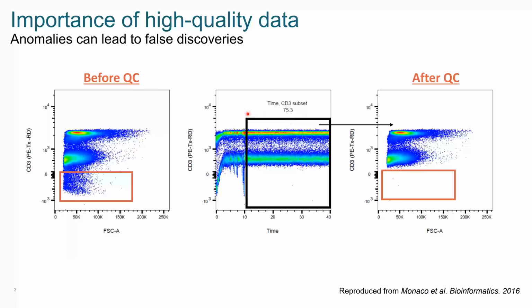And so if I draw a time gate to exclude that region, because we can see it doesn't follow the norm of the rest of the run. Your samples are homogeneous, so your signal should be stable throughout the whole run in theory. If you have a period of instability like this, it could have been caused by some kind of problem with the laser or a surge in flow rate. But nonetheless, we don't want to incorporate this region because it's unstable and unreliable.